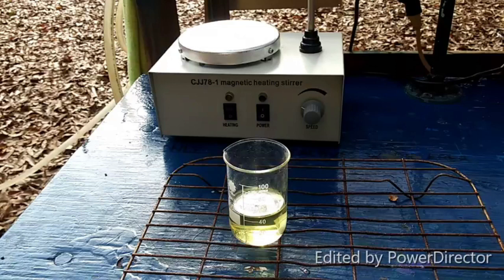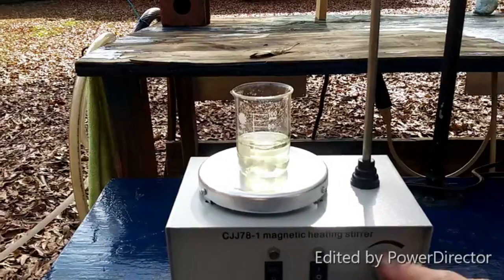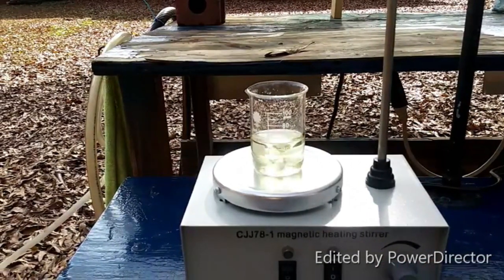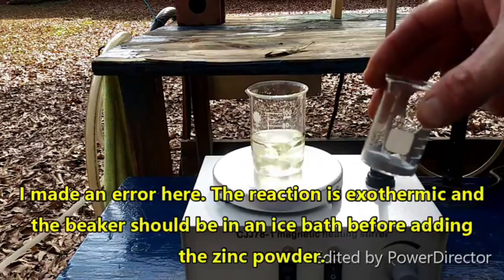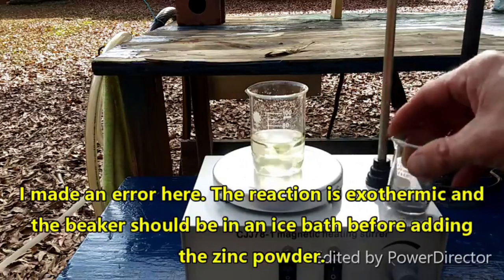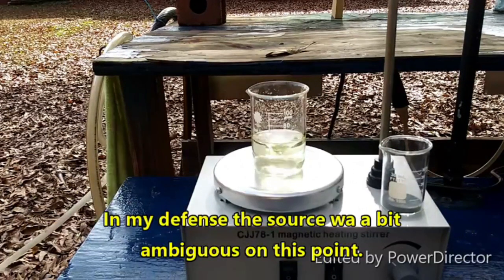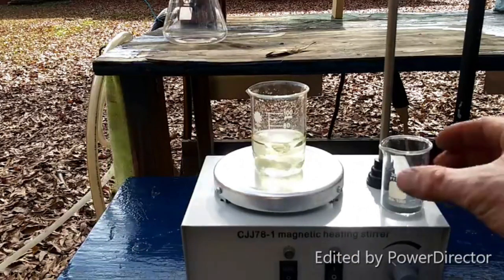Our solution has cooled down — it's actually a little bit under 20°C, but let's hope this works. I'm going to add nine and a half grams of powdered zinc to this, let that stir for a little bit — the protocol says to stir vigorously — then add five milliliters of water and filter it. All right, here comes the zinc.